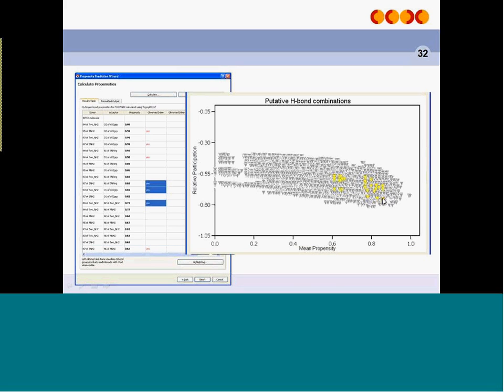And so, without going into too much detail with this analysis, what you can see very quickly is that this second structure looks like a more stable prospect. You can find out this information quite quickly. And indeed, if we go back to the thermodynamic information available for Famotidine, it is this second form here that is the more stable one.